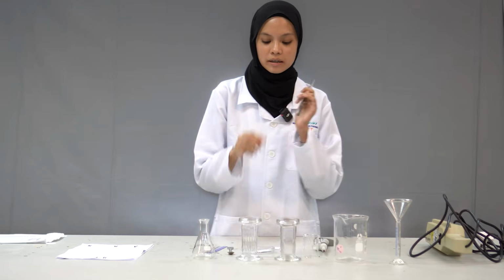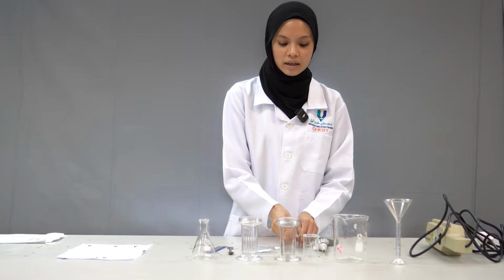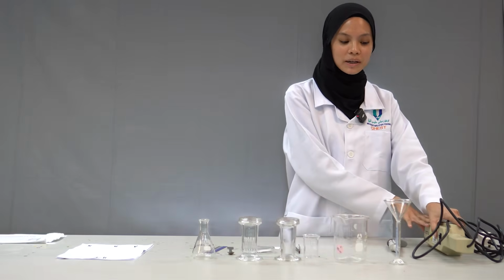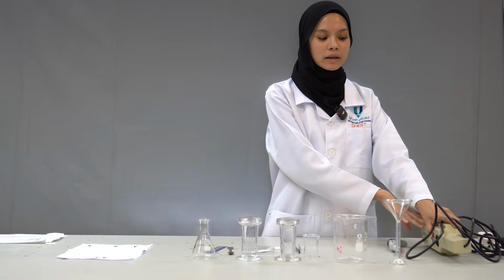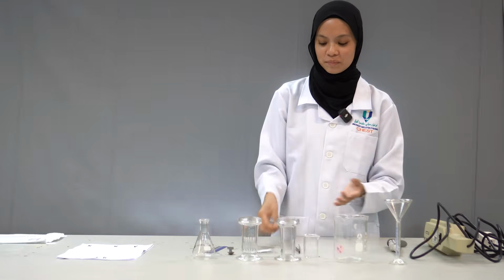We are using forceps because the plate is extremely sensitive, so to avoid contamination we use forceps. This is the micropipette, I'm sorry, we're not using this. Since we are dealing with colorless solutions, we are using the UV lamp to help detect the spots on the plate. Now I will pass to Aisha to proceed with the procedure.